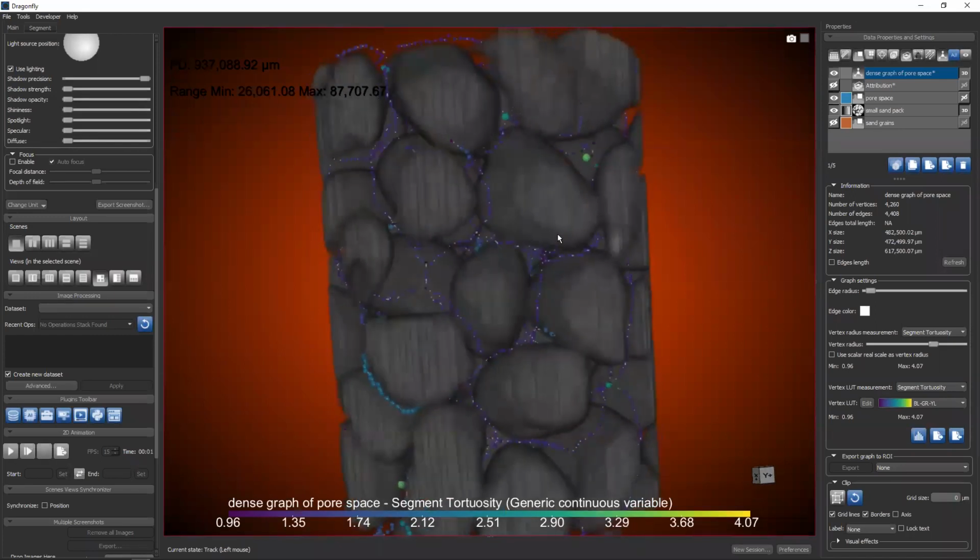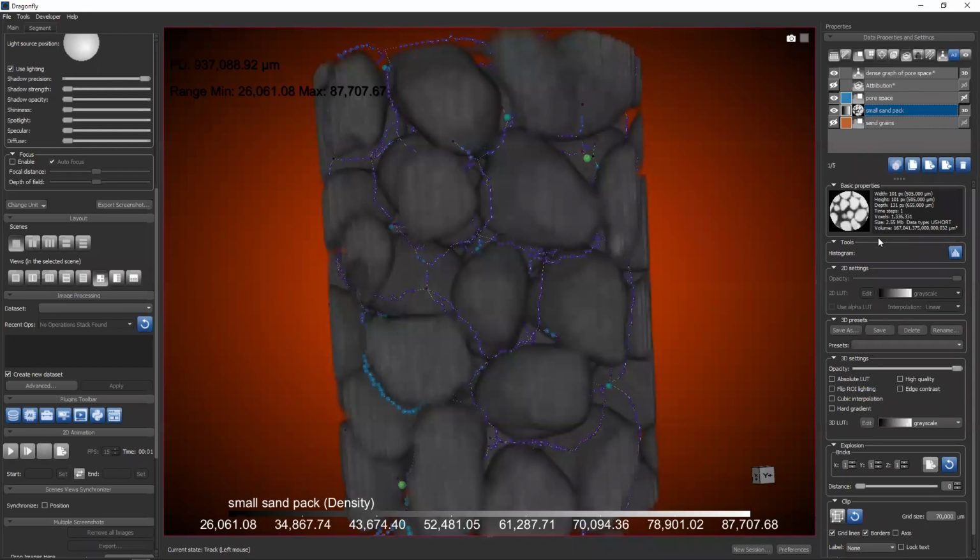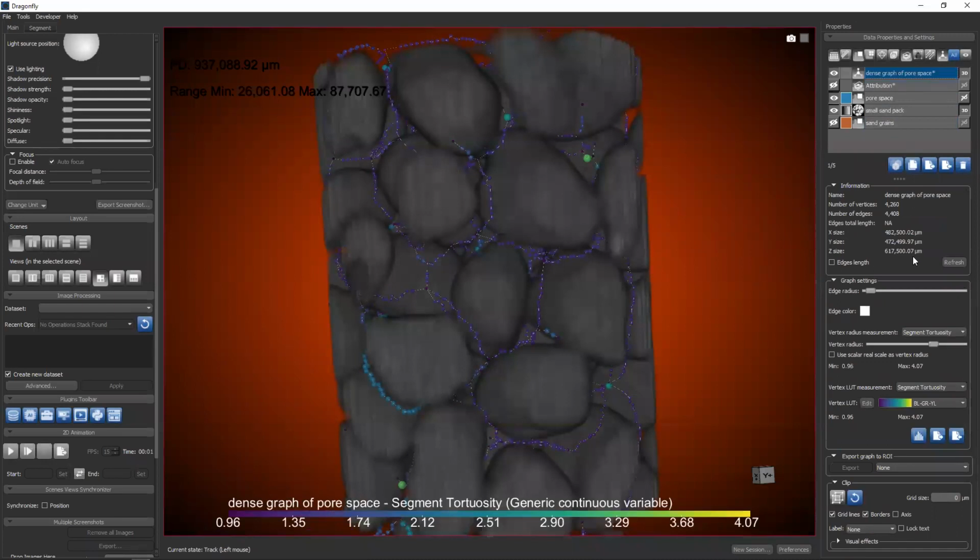So we have this graph object, and if you look over on the right, we saw on Monday, in lesson 1, that you have the property panels for images. We saw on Tuesday that you have the property panels for meshes. So here we are on lesson 3 looking at the property panels for graphs. Now, what we see down here is some information about the graph: how many vertices, how many edges. We also see that under graph settings, we can affect how the graph is visualized.